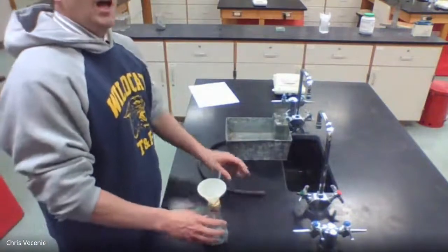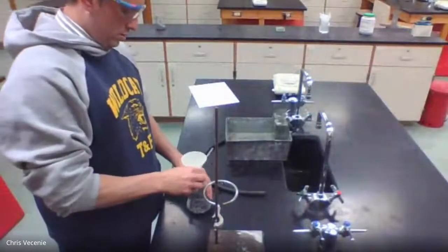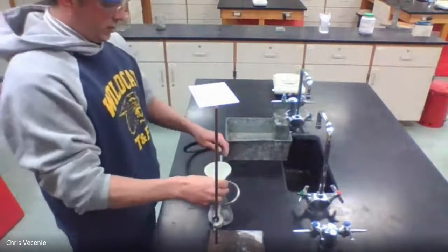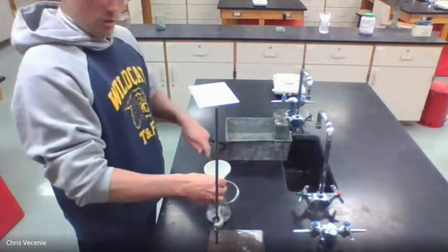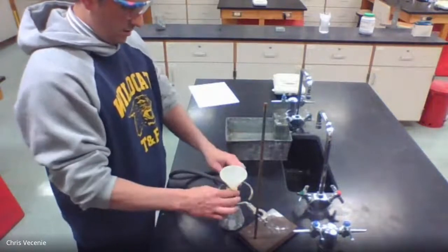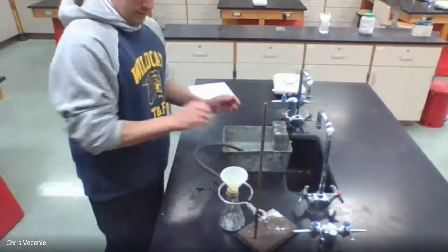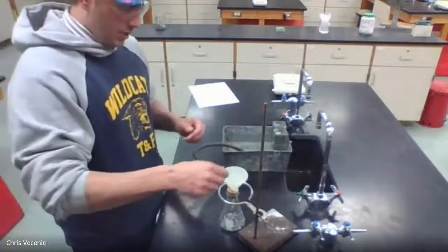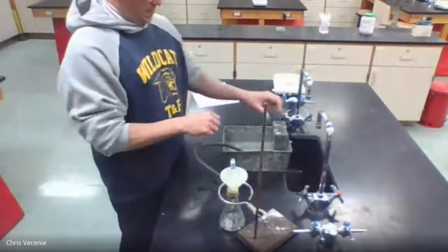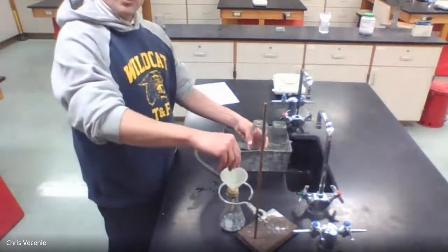So just like last time, I'm going to set up a little bit of an apparatus because I'm by myself, just to help me hold my Erlenmeyer flask in place, just so the weight of the tube doesn't tip me over. So we're going to put our tube on, try to angle this so that you guys can see what's going on. Okay, so we have that guy here, and I'll slide this guy over a bit. All right, and just like last time, I'm going to take a pipette, shove the pipette as far down into that tube as it will let me go. And then I'm going to hold the bottle and the tube, and I'm going to inject.